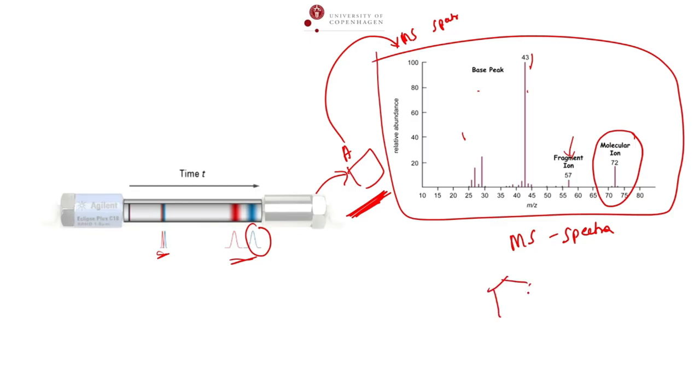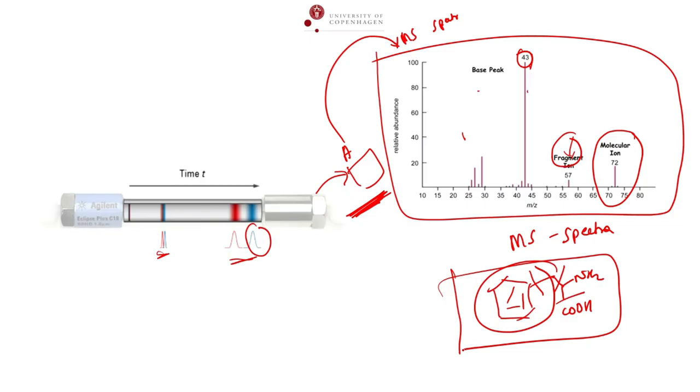In the mass spectrometer, let's say one example. Let's say you have a compound that looks like this. In the mass spectrometer, it will be fragmented in different possibilities, right? And each fragment will give you one kind of ion here. It is very unique to that particular molecule. Now I can get more information about the molecule, its structure. I get the mass, I also get the fragmentation pattern, and that gets me the structure of the molecule. So structure elucidation becomes super useful with mass spectrometry.